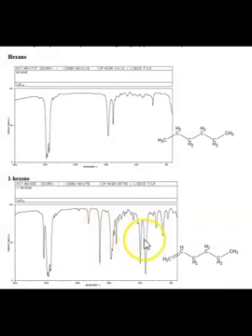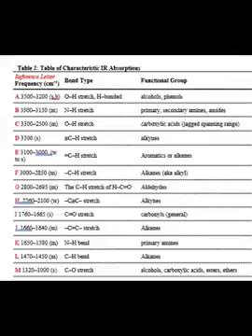Okay, so we're just learning how to read these, but let's go back and make sure we find out what that stands for. That little peak that we saw then was a CH stretch, right? So we saw it to the left of 3000. Now it says weak to strong, so it depends on the molecule, okay?